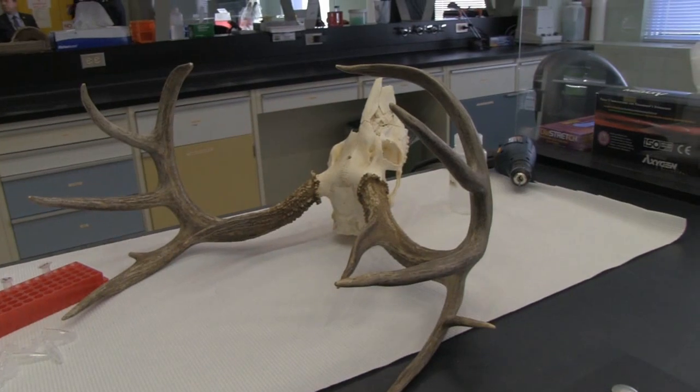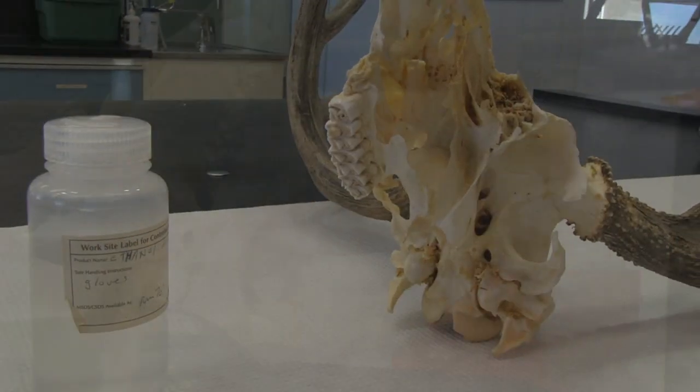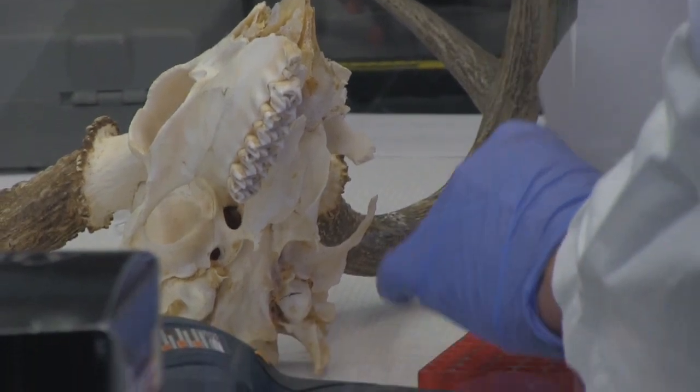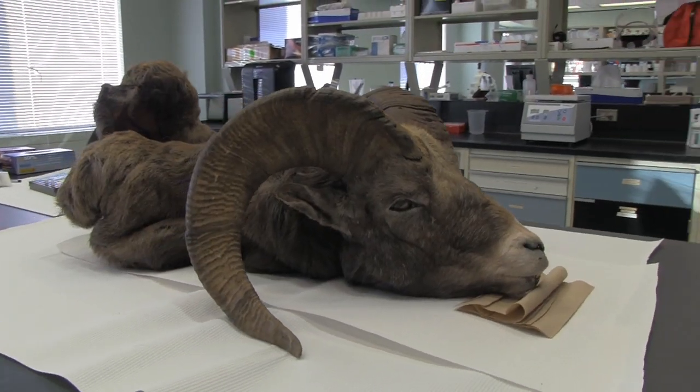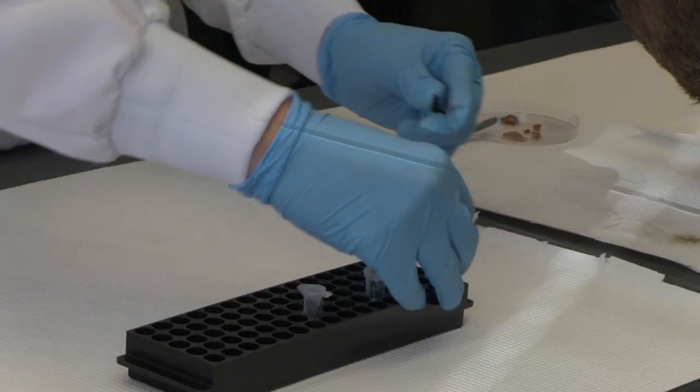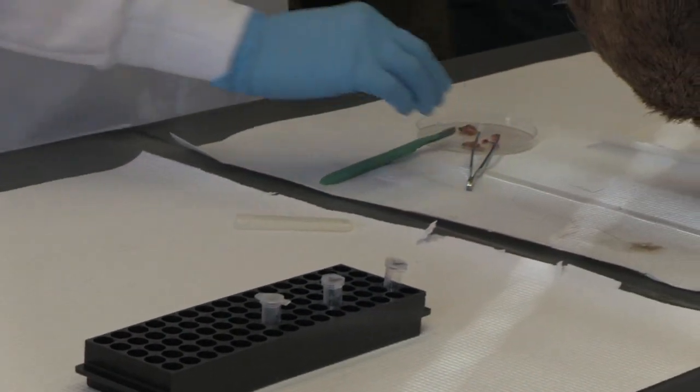We'll do DNA typing on samples from the incident scene of the crime and samples from the suspect, samples that were in the possession of the individual they're investigating. So we'll do the DNA typing. We'll look at the DNA types, see if they're a match. If they're a match, we can indicate the statistical likelihood of that taking place, and then the officer can proceed with laying charges and taking the individual to trial.